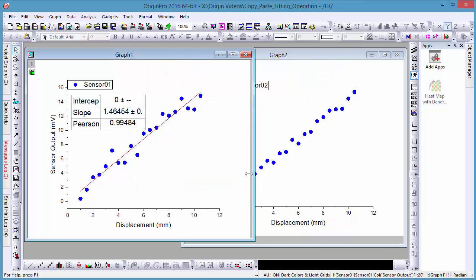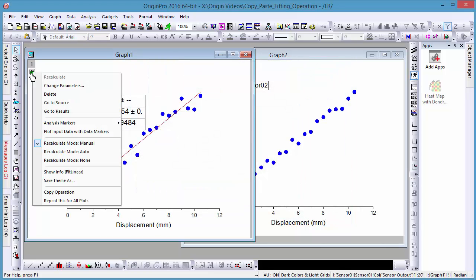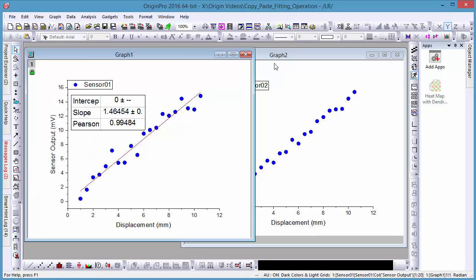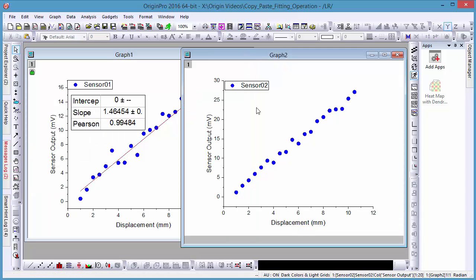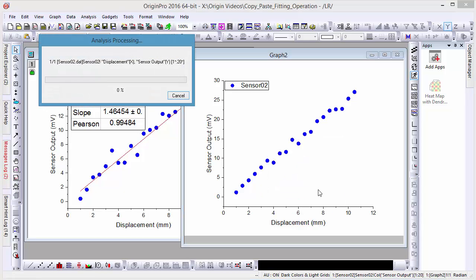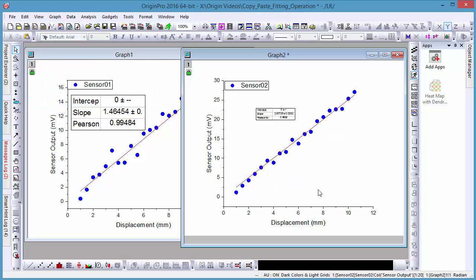To apply this same fit to our other graph, we can click on the green lock icon and choose Copy Operation, and then right-click on our new graph and select Paste Operation. As you can see, the same linear fit with a fixed intercept at zero has been performed on data in the second graph window.